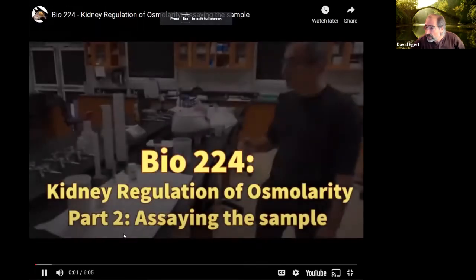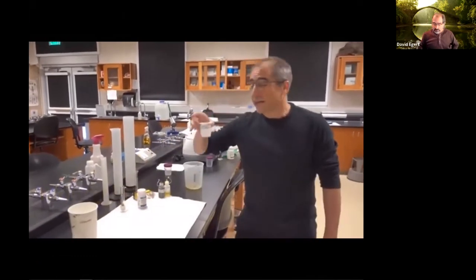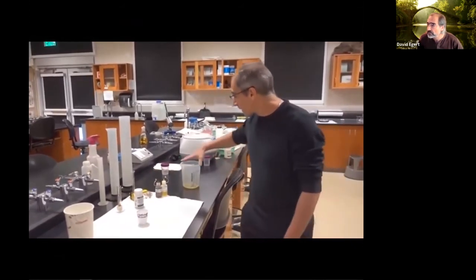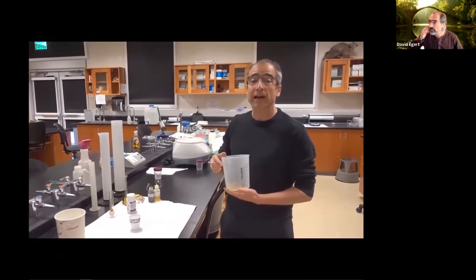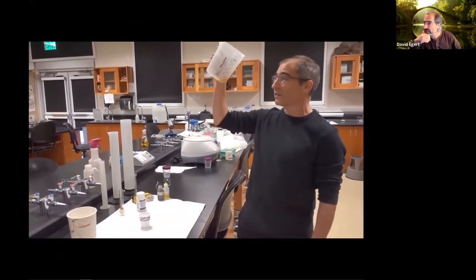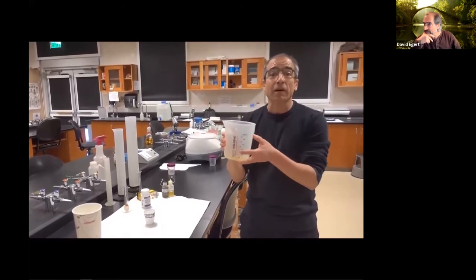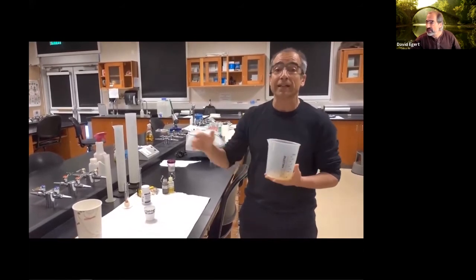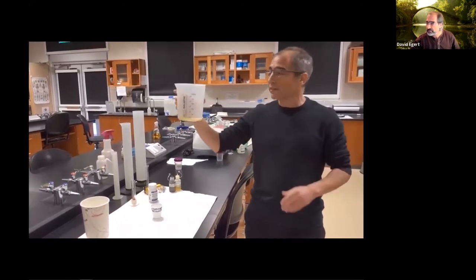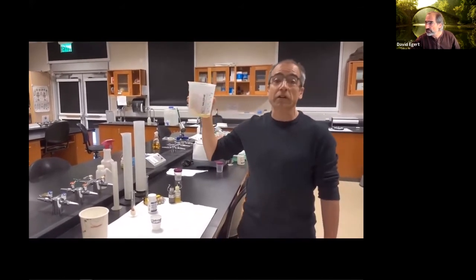All right, so I've been in group 3, which was just drinking 80 mils of water and taking 1.5 grams of salt, and this is a half hour after I did my initial voiding of my bladder and taking my treatment. And here's the amount of urine that I've got. Again, I'm collecting every last drop, because I care about the volume. So this is not a clean catch like you were doing in the urinalysis lab. You're going to collect from the beginning to the end of the flow. And first thing I want to do is figure out the volume.